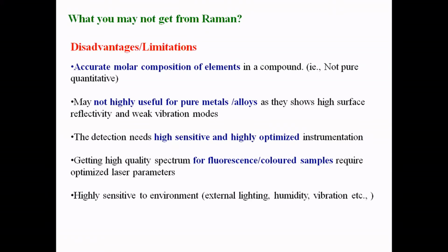And of course fluorescence is a very big challenge. Mostly organics with functionalities have a fluorescent effect, so one has to carefully select the suitable laser and parameters to get a good spectrum. And of course it's sensitive.